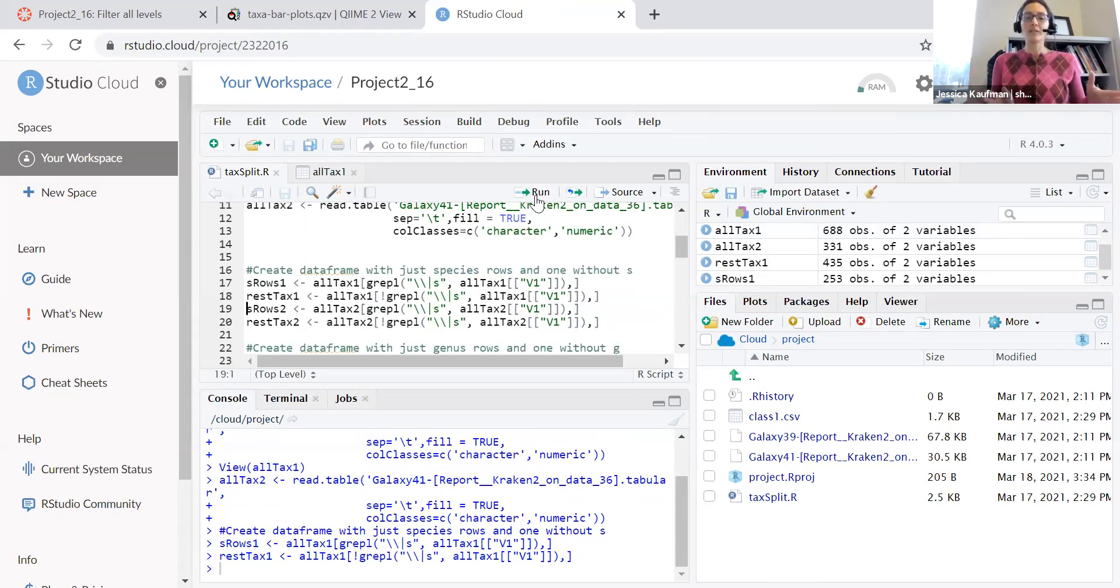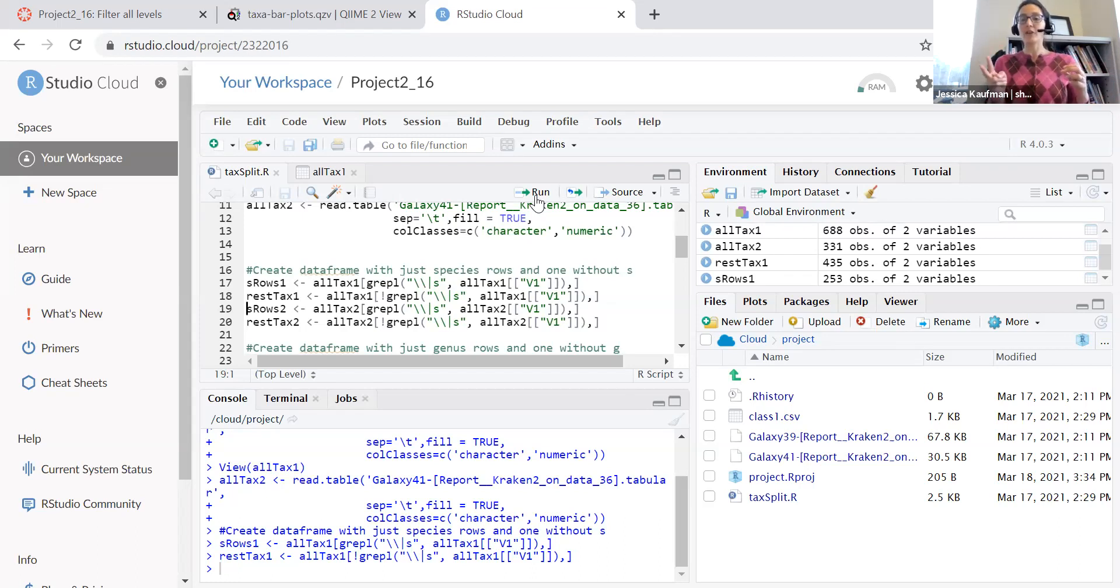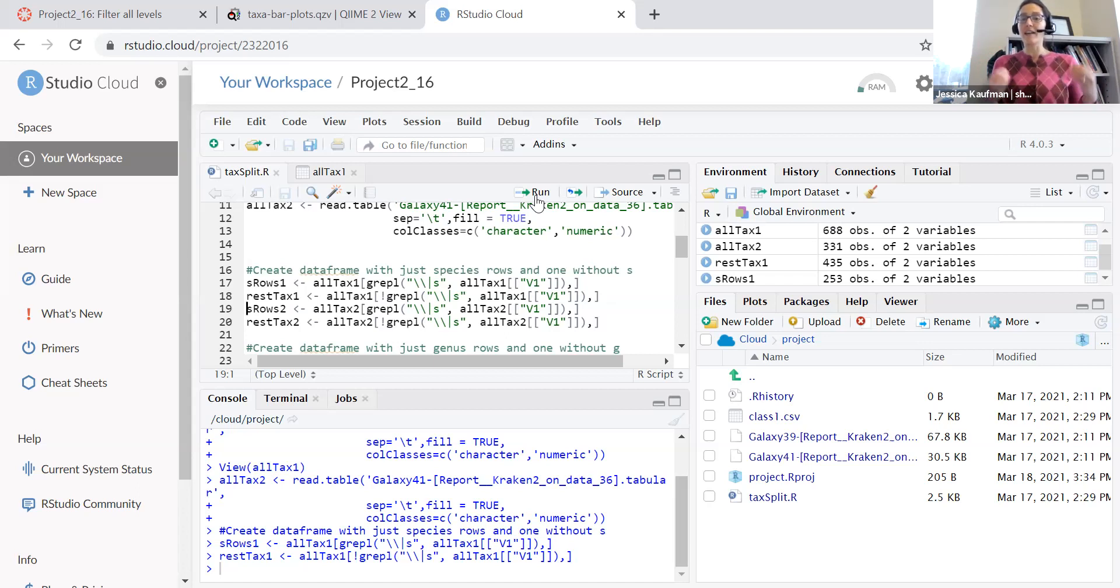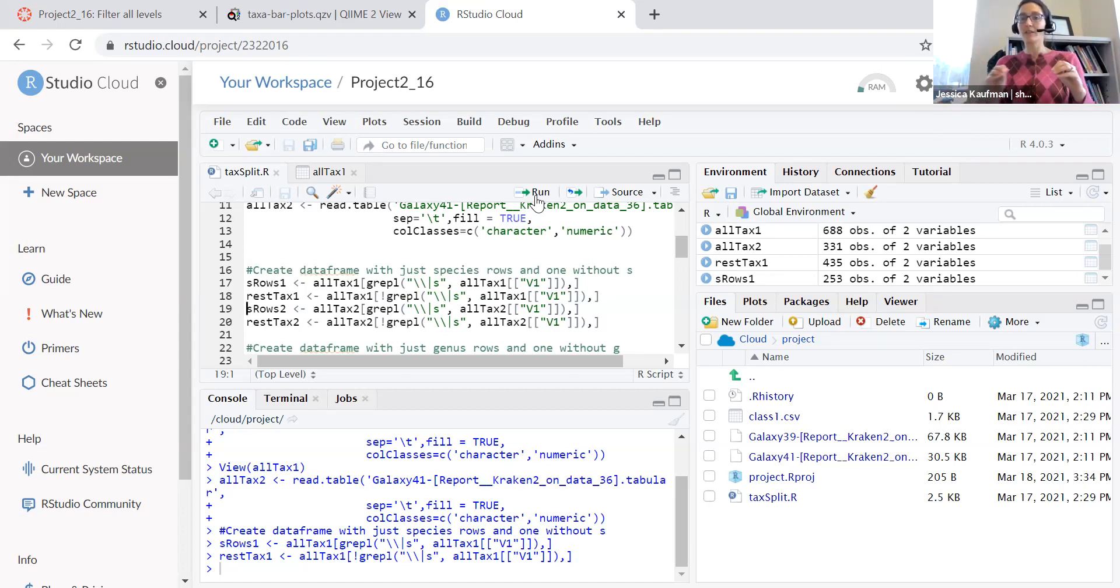So let's do some simple math to make sure that this works, right? 688 was my original number of rows and now I have two data frames, 253 and 435. If I add those together I get 688 so I know this worked perfectly. I have a list of rows that had species and I have the rest of the rows.